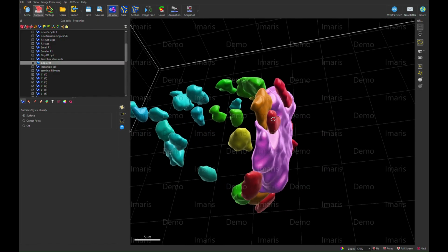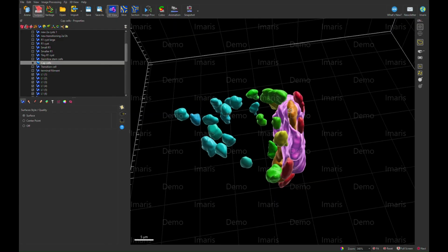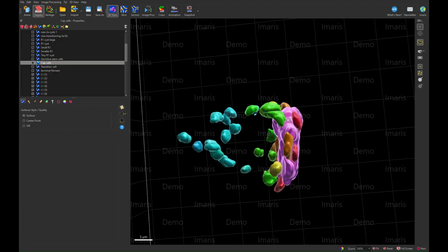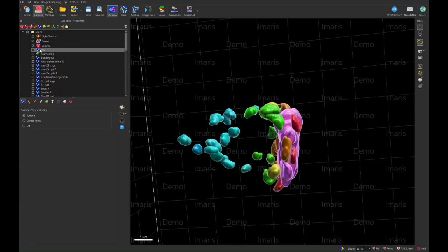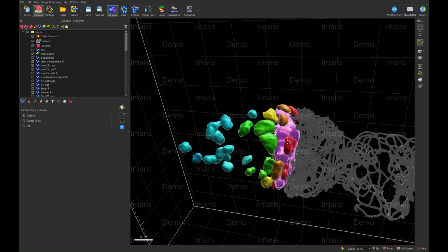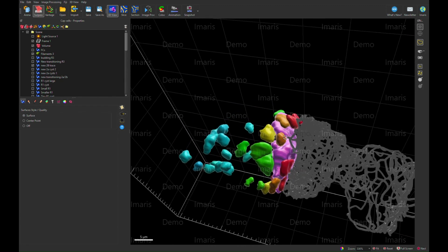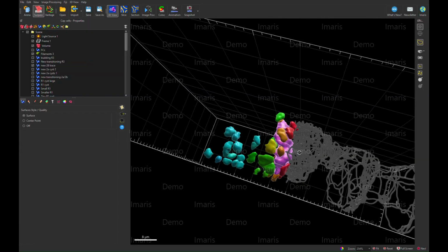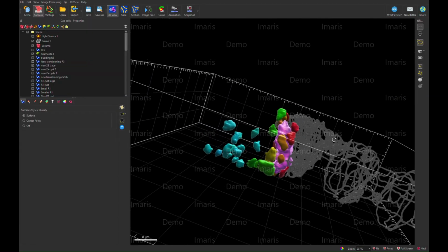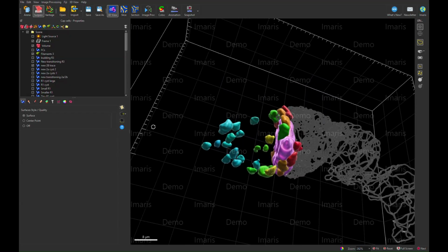Okay. They really squeeze their way in there. You can see how the 2B cyst really bends around it. And there you can see that it is abutting the Fas3 expression outlined in gray, but nothing is encapsulated by it. Once encapsulated by Fas3, it'll be considered differentiated from a follicle stem cell into a follicle cell. So the ones that are closest to it, the layer 1s, are going to be the next ones to differentiate.